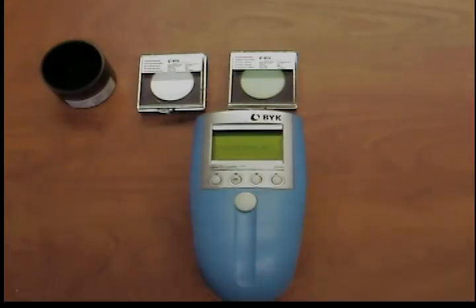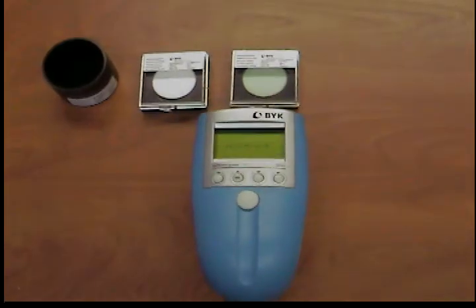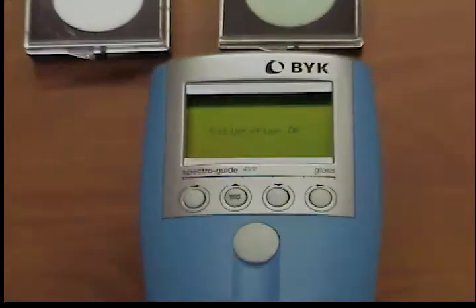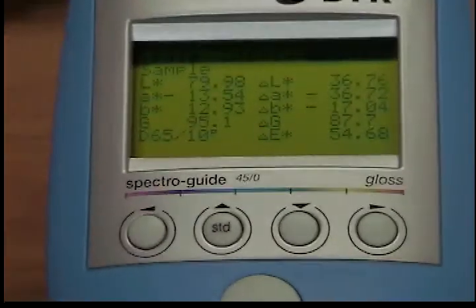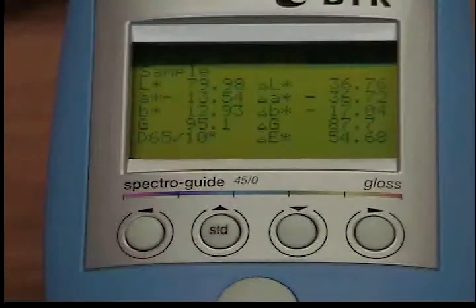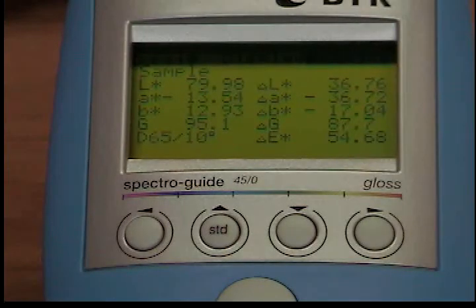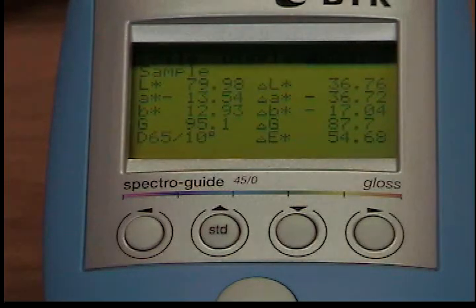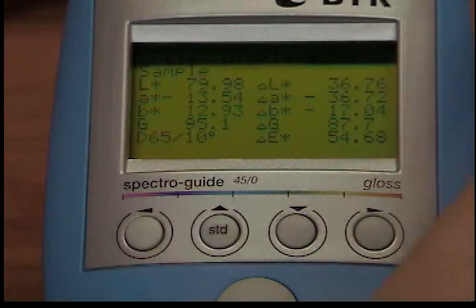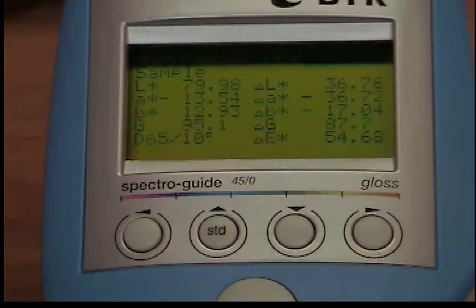If calibration was performed correctly, the message 'Calibration OK' will appear on the display. The instrument returns to the previous measurement mode. Use the test with the green standard again to determine whether the calibration was performed correctly.